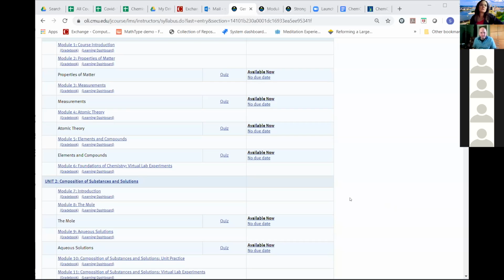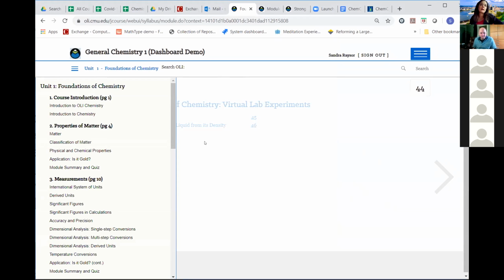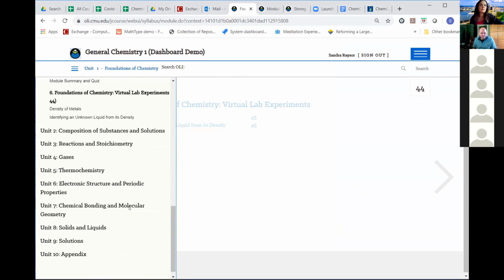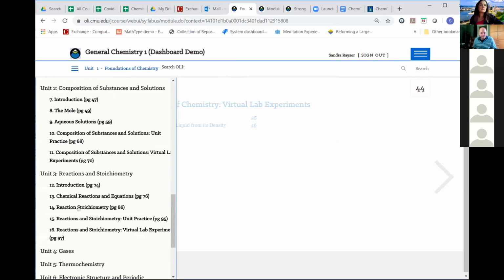Okay, so I just wanted to jump into the course and show you the virtual labs that are within the course. As Dave mentioned, these are not randomized, so all the students will have the same answers.